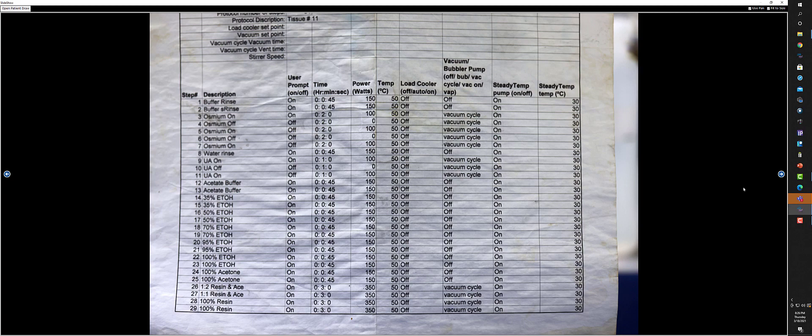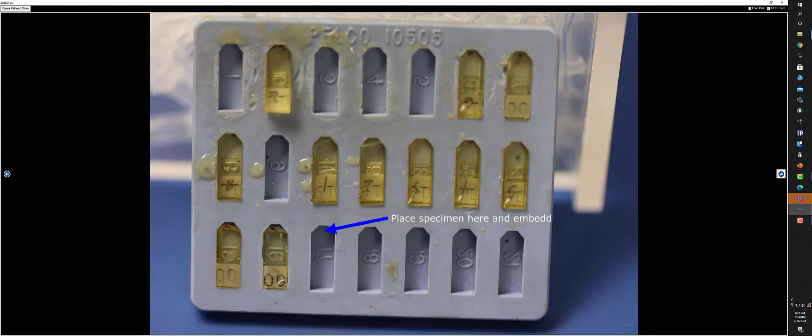Basically you rinse it, you post-stain it and post-fix it with osmium, post-stain with uranyl acetate, and then dehydrate in a series of ethanol dehydrations, finishing with acetone. And then you embed it with epon, which is a resin. So there are almost 30 steps in this process.